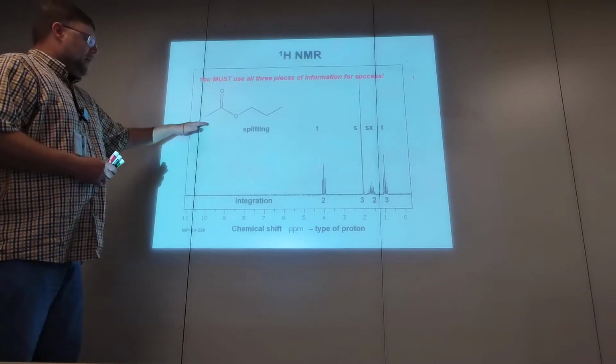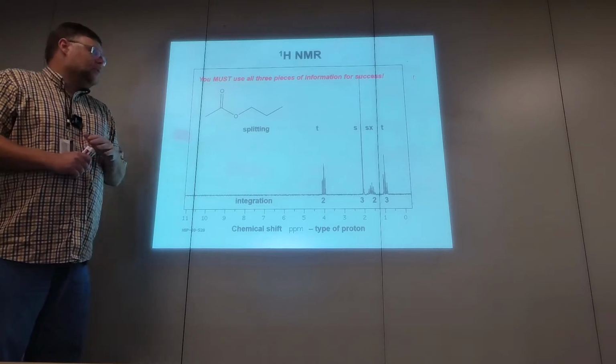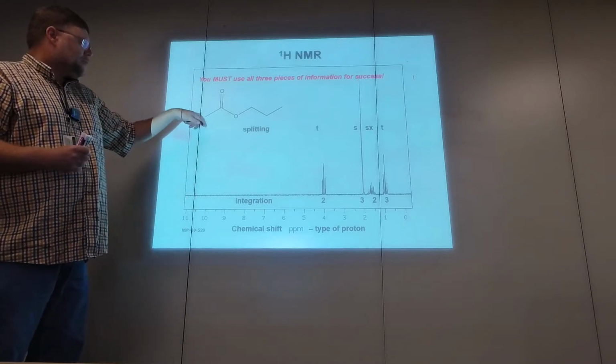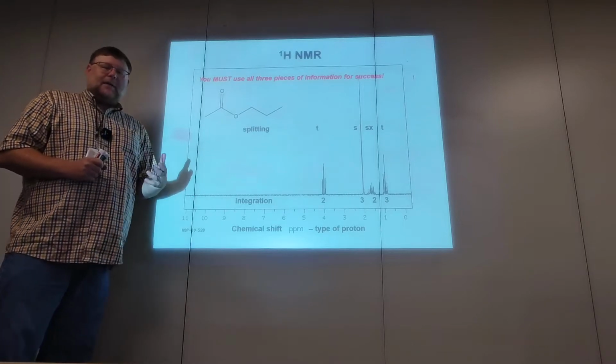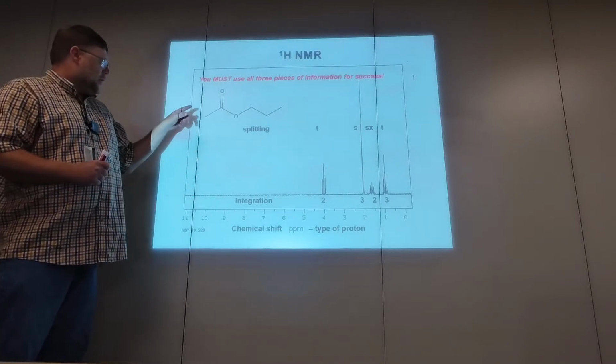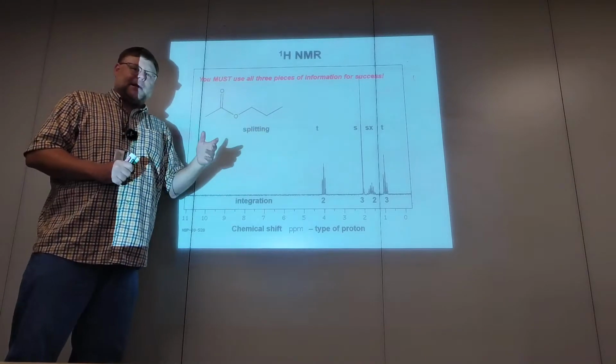So here's the molecule. All right, so here's the molecule that gives rise to this spectrum. Now, I do want you to hit pause. First, hit pause, write in all the protons on this molecule, and then assign them. So, the protons on this carbon go to which peak? The protons on that carbon go to which peak, et cetera. All right?